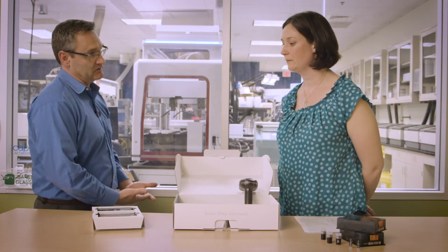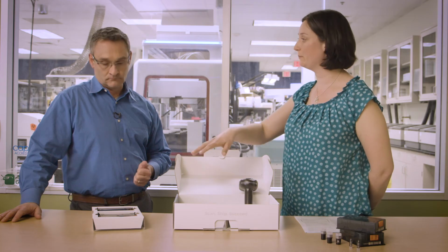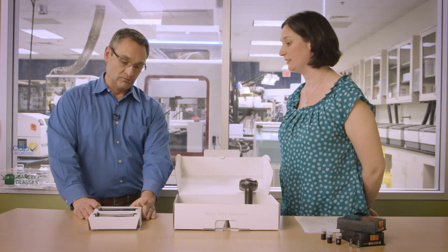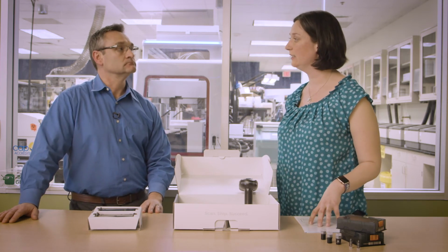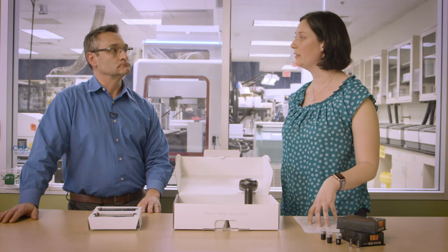So now I'm ready to send that in. What's the next step that I need to consider? So once the samples are in the tubes, they can be sealed and then frozen, and then when they're ready to be shipped to Metabolon, you want to put these racks back in the cradles so that they're protected. And then you'll want to refer to the sample submission guidelines to determine how much dry ice you should put in the box so that we can ensure that those samples arrive to us frozen and intact.